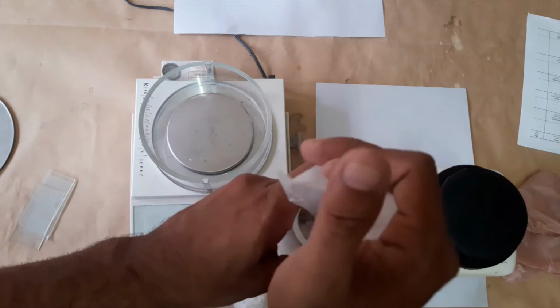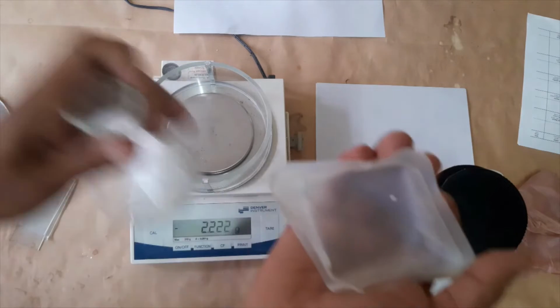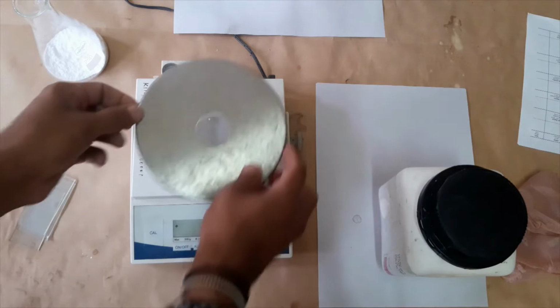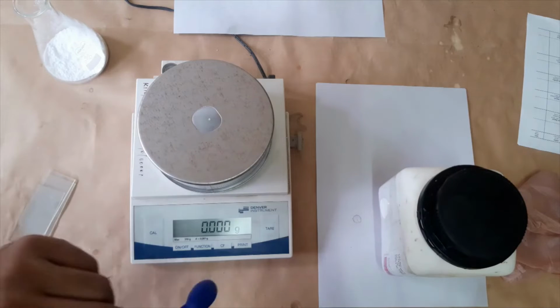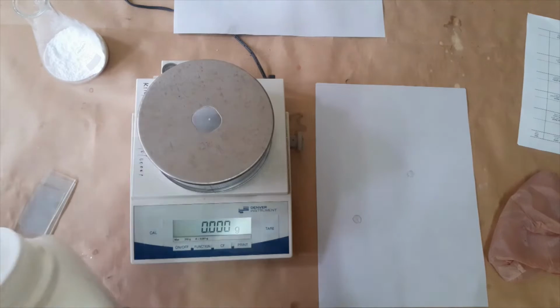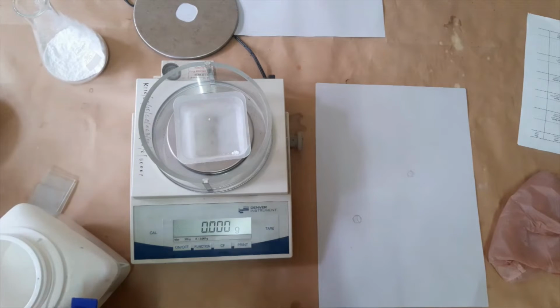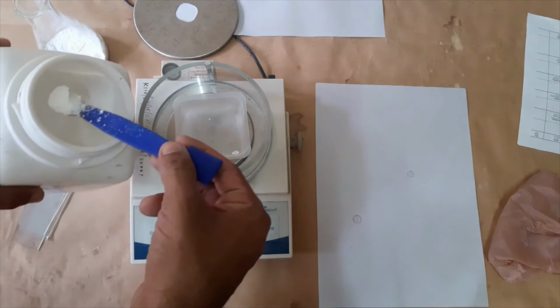We have to measure another 20 grams from the other silica gel type. Okay, I will use the same weighing pad, doesn't matter because we are going to mix. I will close the lid of the balance, and I will make it zero, and I will use a new spatula for measuring this 254 silica gel. Remove the lid. Okay, we will measure another 20 grams.